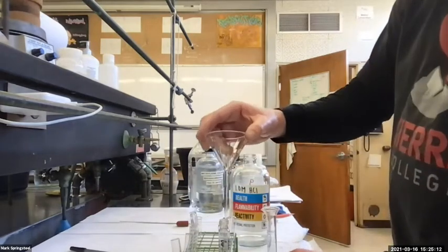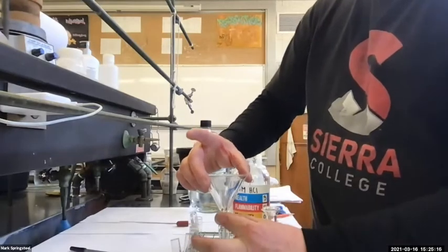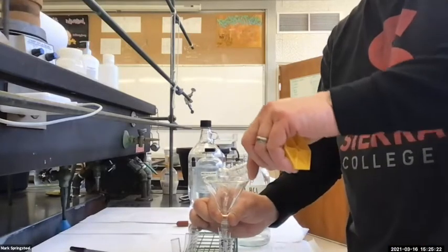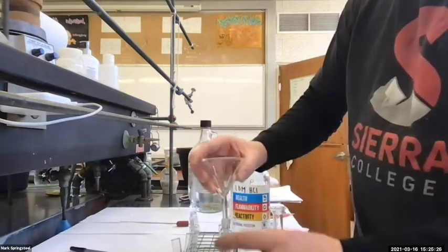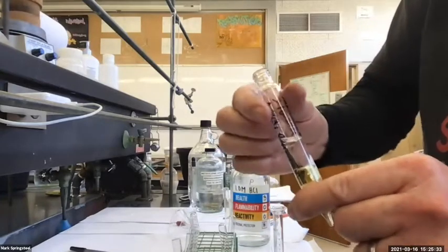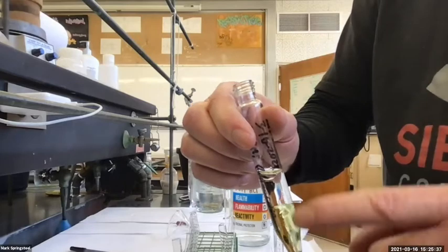Okay, so I'm going to add the 1 molar HCl. I'm holding it a little above, right-handed. So I'm going to let some air out as this goes in. All right, I got that in there. It definitely looks like 2 layers for sure, huh? And right now, can you see the difference in clear and clear yellowish? Yep.